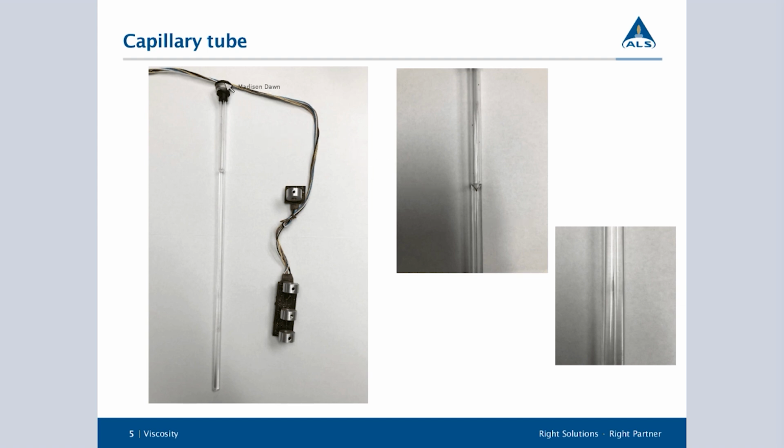So this is that top we saw where the oil goes down. You can see in this picture that the top portion is a lot wider. It's what houses the oil when you first inject it, and then you get into a much thinner capillary portion. I've included this sensor over here that we use. This first sensor sits right here and allows pressure to be held so that we can control the rate that we drop it.